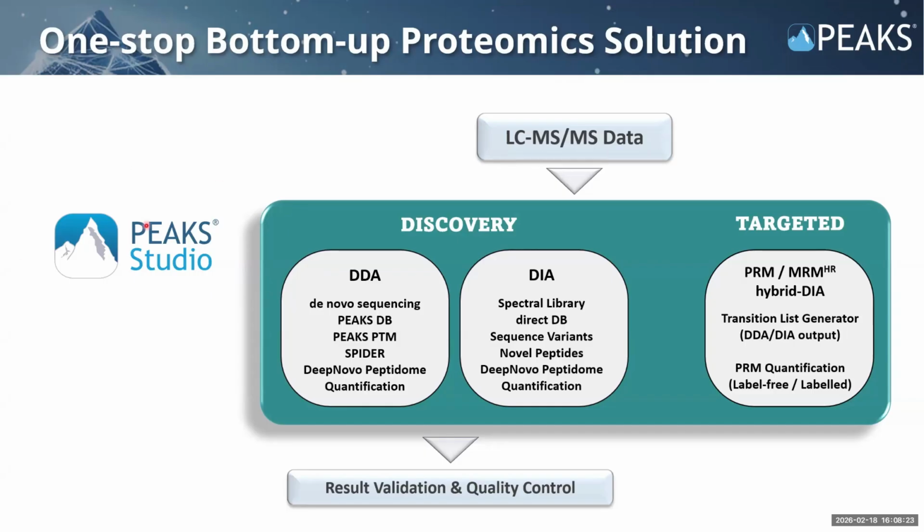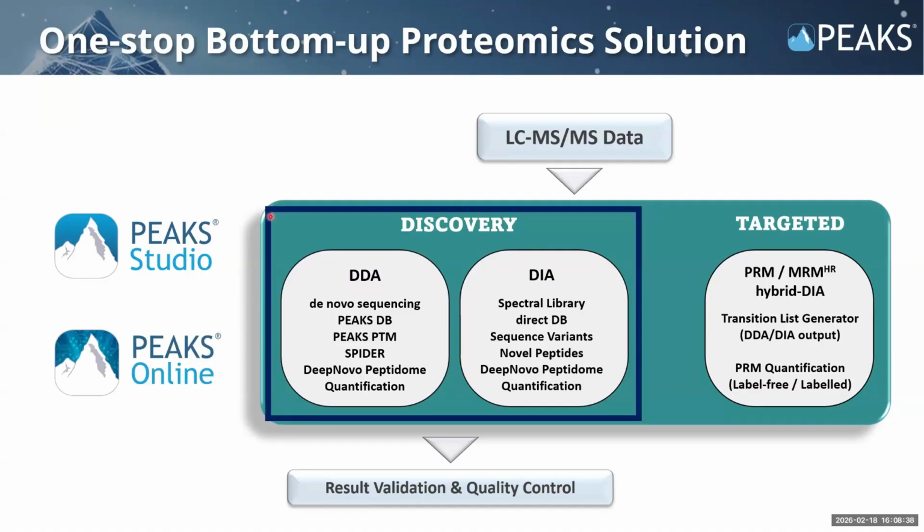And Peaks Studio provides the complete bottom-up proteomic solution to handle both discovery, so DDA and DIA data, as well as our targeted solution as well for PRM and hybrid DIA. Now, for Peaks Online, we are mainly focused on discovery proteomics, so mainly our DDA and DIA workflows. However, we hope to expand in the future into our targeted solutions.